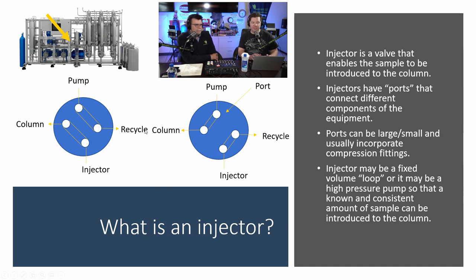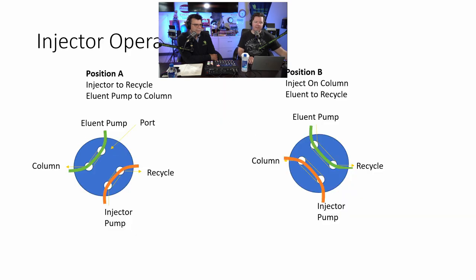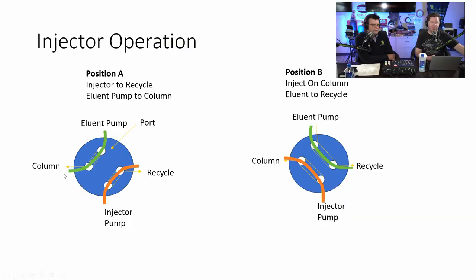Now the valve switches. It actually turns, it's rotary, and the pump is now connected to the column. You can see that. And now the injector is connected to the recycle. So that's what the valve does. So here I have a little illustration of that.